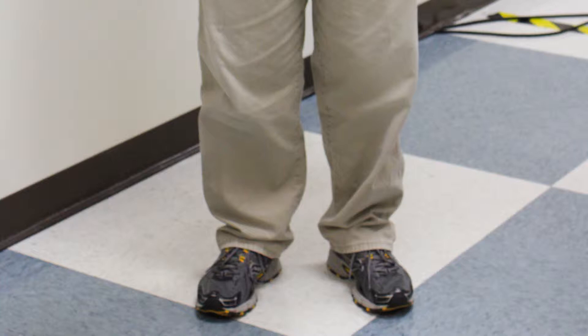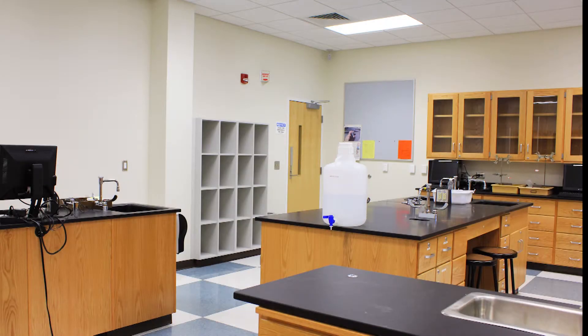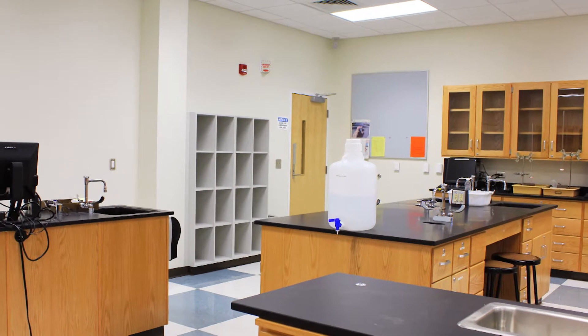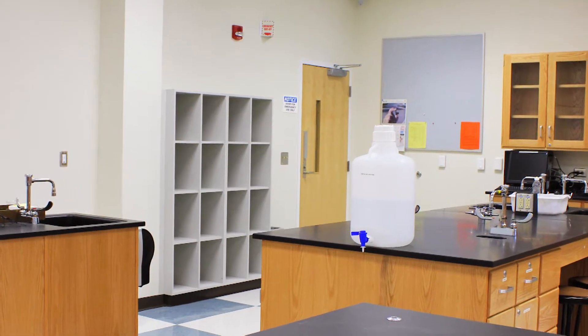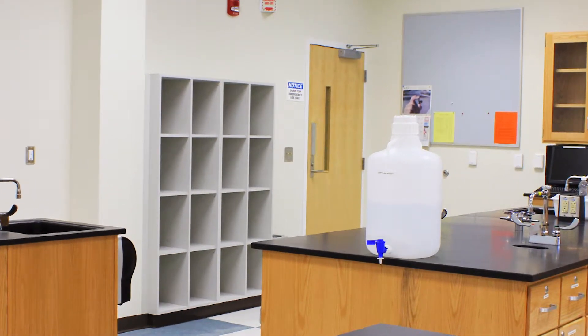When you first enter the lab, put on your safety glasses before you sit down. Place any unneeded books and coats in the appropriate place. This is by the emergency exit opposite from where you enter. Only bring your lab manual, something to write with, and a calculator if needed to your lab bench. It is not appropriate to place books or coats on the floor as they are a trip hazard.